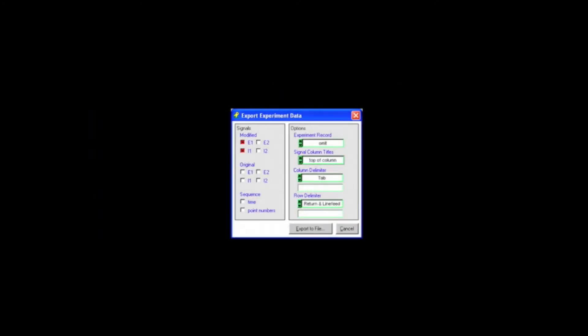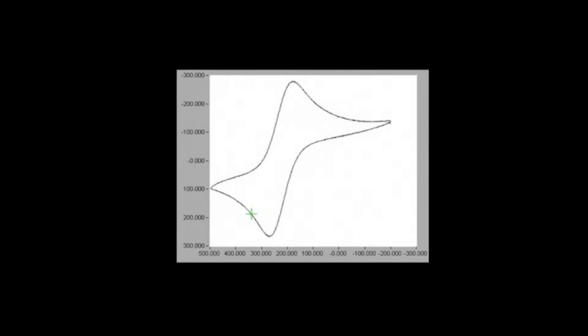After the second experiment has been completed and the data has been obtained, it needs to be exported for analysis. Under the file menu, click export. Only the E1 and I1 data is needed. All other boxes can be unchecked as shown. When graphed, the data should look similar to the plot shown.